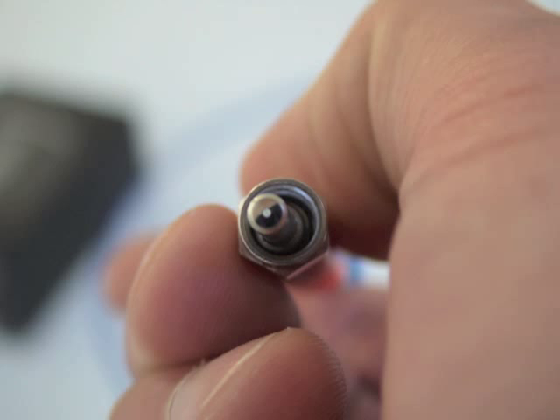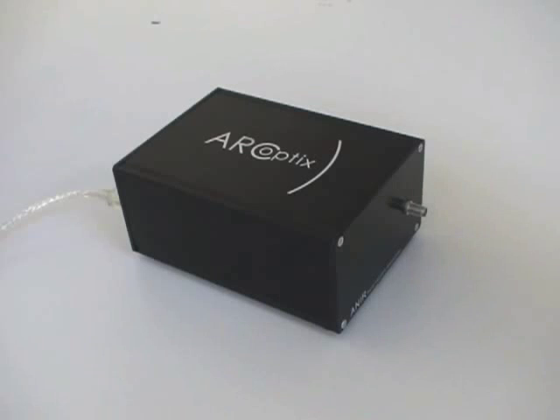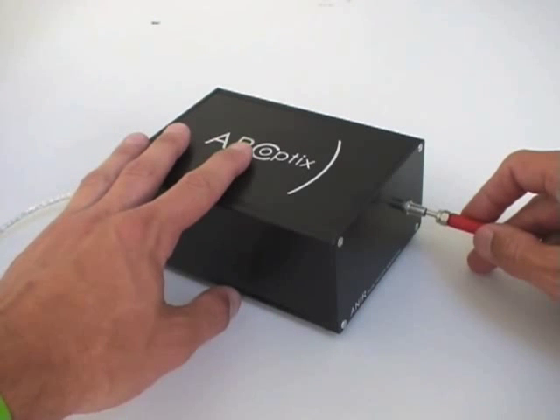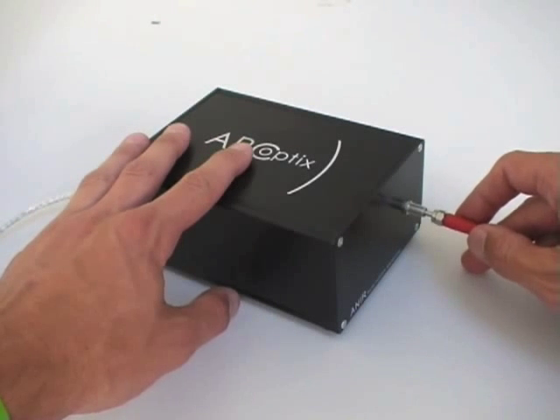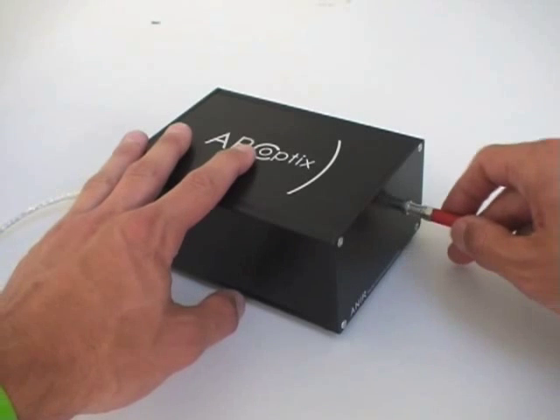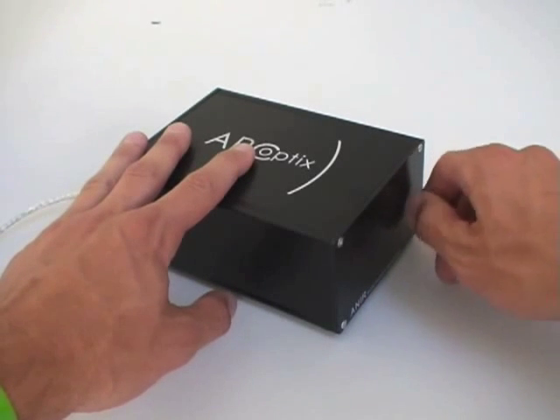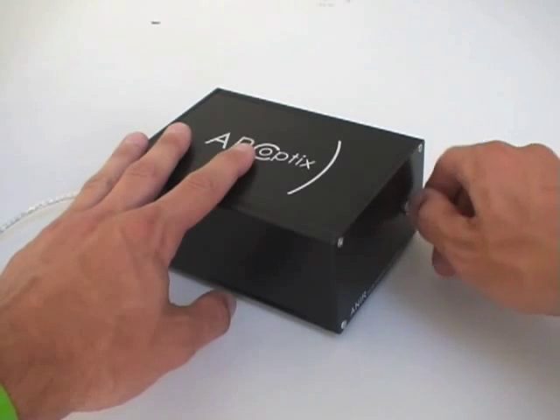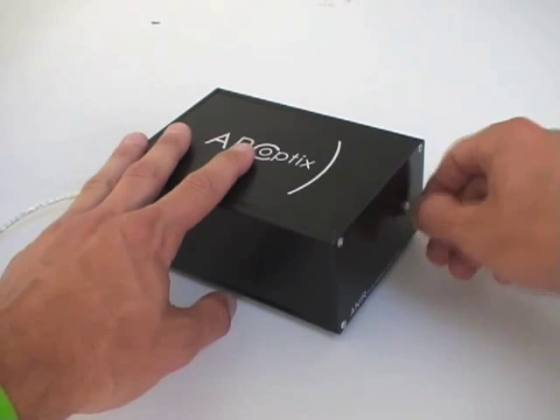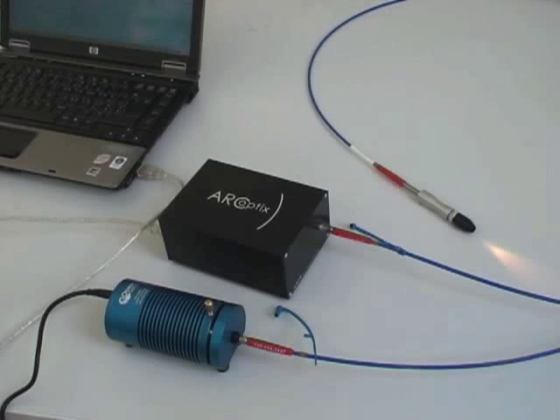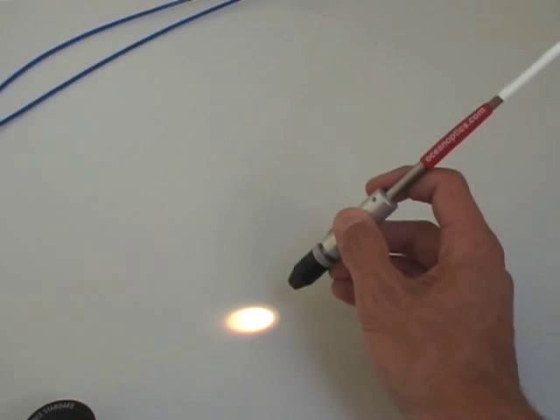The other end of the bifurcated probe has a single optical fiber in it. This end goes into the spectrometer. Your hardware is now ready for use. Just ensure that light is coming out of the fiber tip.